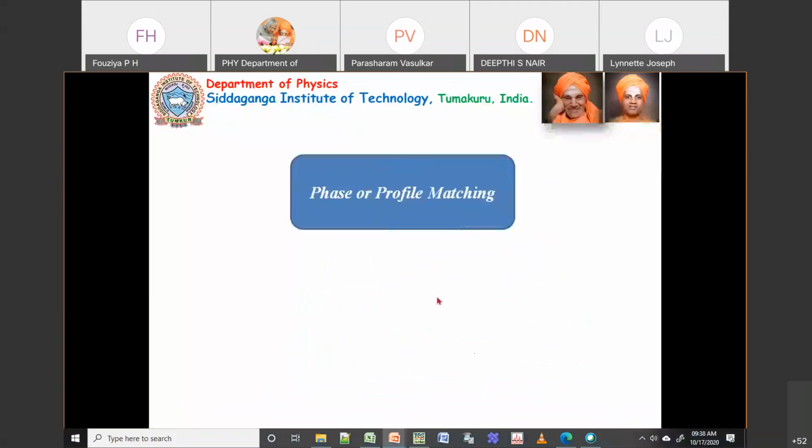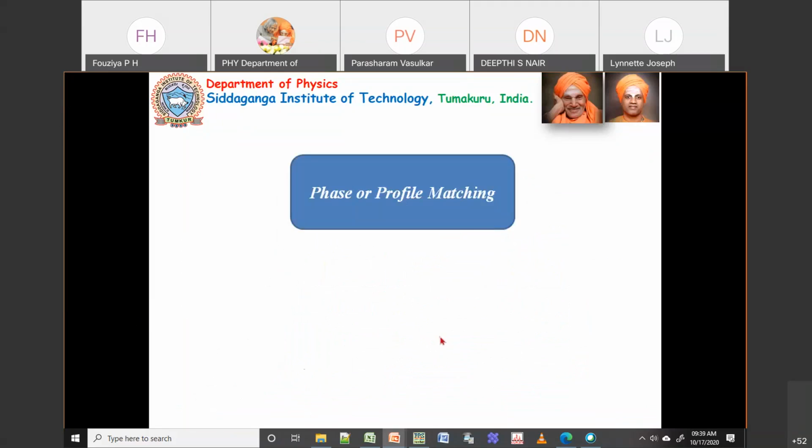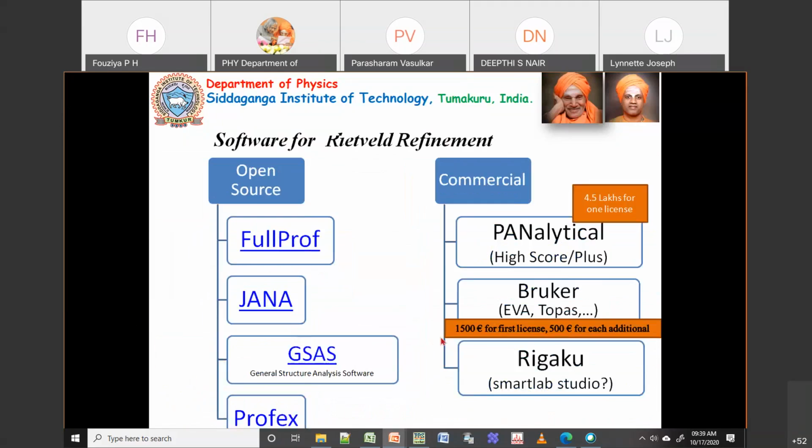and then we'll start here. So why do you need the phase analysis? If you see some papers, what they normally do is take some JCPDS data. JCPDS and ICDD are both the same. We already discussed this in the previous session.